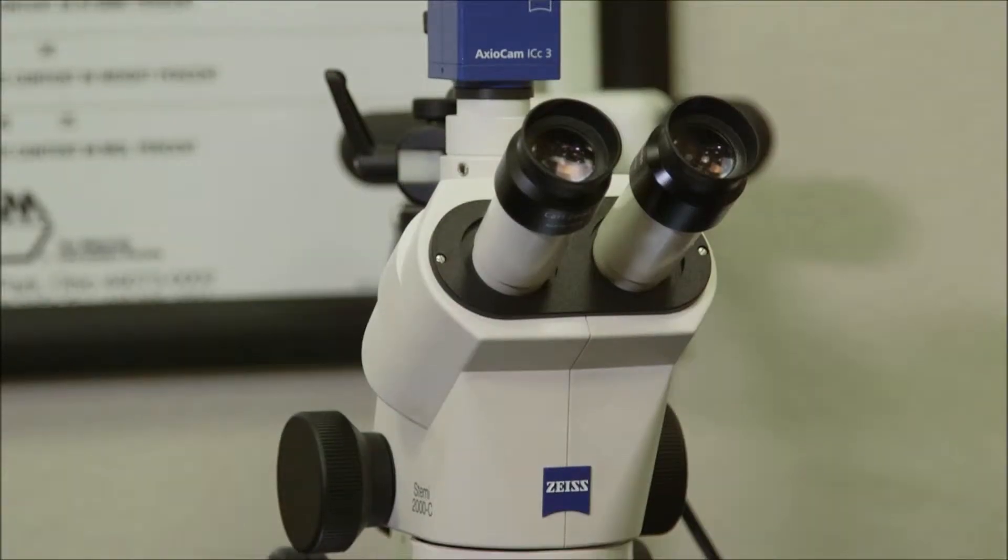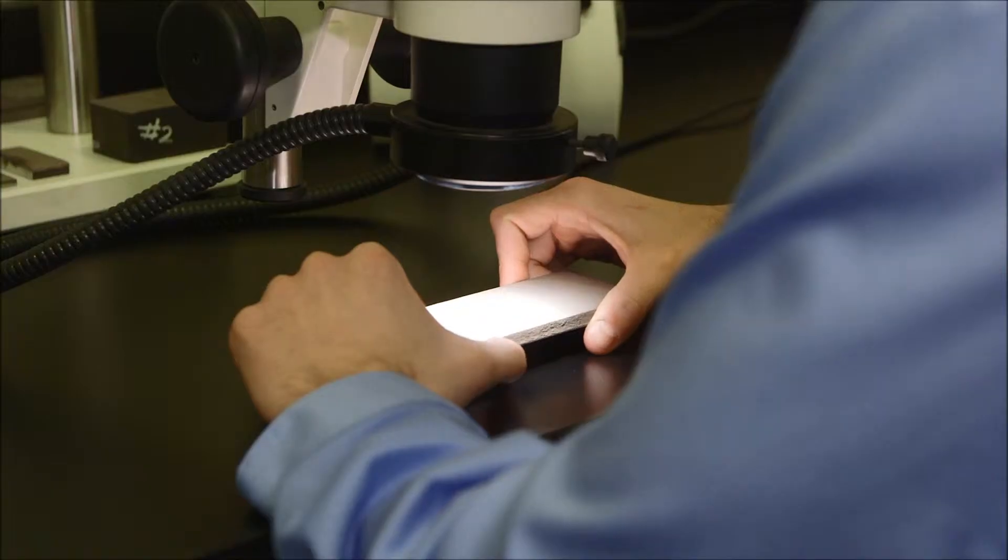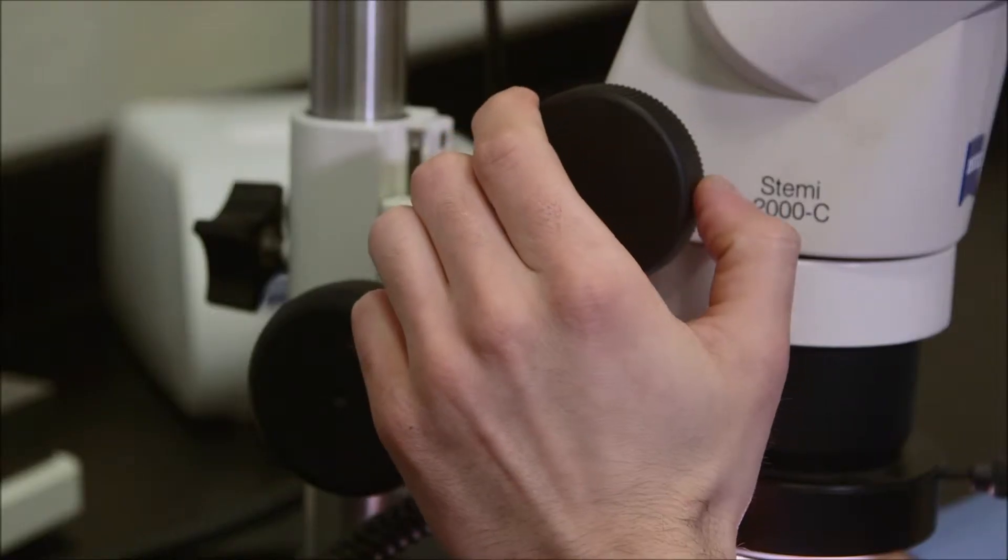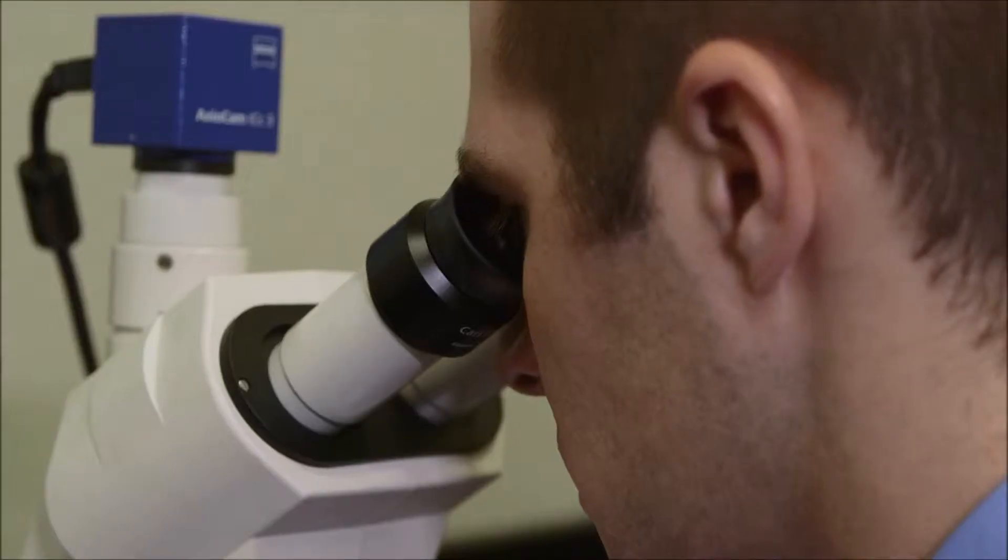Another very useful piece of equipment we have for performing failure analysis is a STEMI stereo microscope produced by Zeiss. And what this allows us to do, if we receive a component that comes in from the field that's failed, if we just want to get a nice look, it doesn't have to be very, very high magnification, but if we just want to put it underneath the microscope and get an idea on where the failure origin might have initiated.